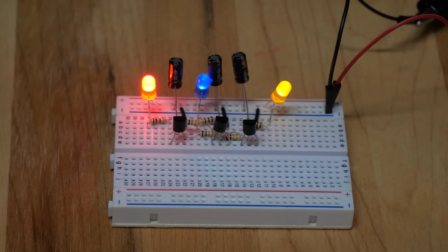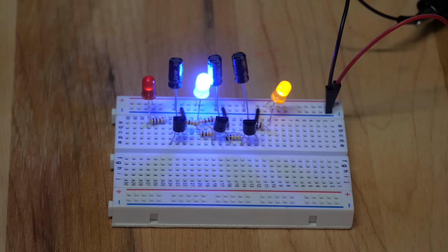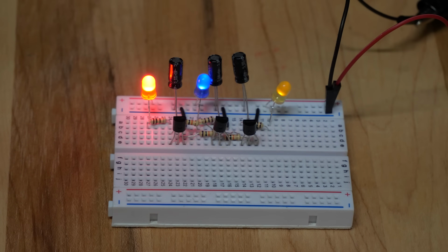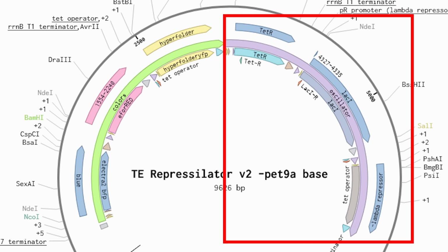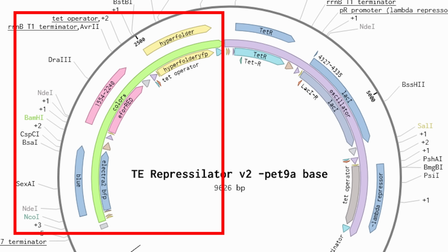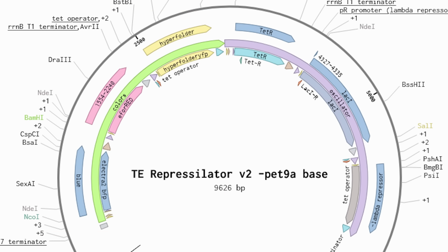The capacitors in this circuit sort of represent how much protein is built up. Even when the next element in the circuit is being triggered, it does take time for the previous one to clear. The DNA version is very similar. Like before, it's divided into two sections, the oscillator part and the reporter part. The oscillator is made of 3 repressors wired in a loop, and we've got 3 fluorescent proteins to act as our LEDs. And I've chosen the colors to be as far apart spectrally as possible to make them easy to differentiate and see if this is working.